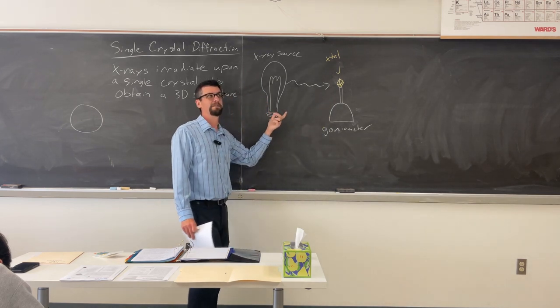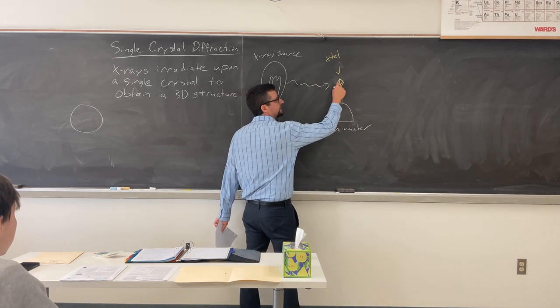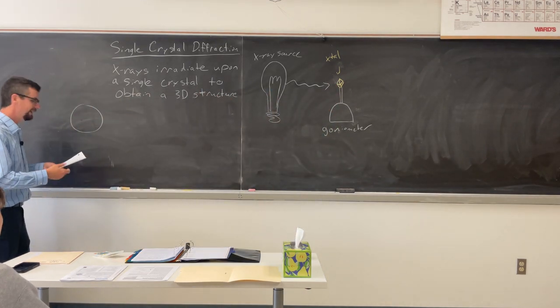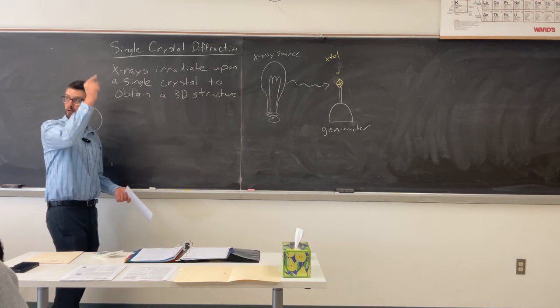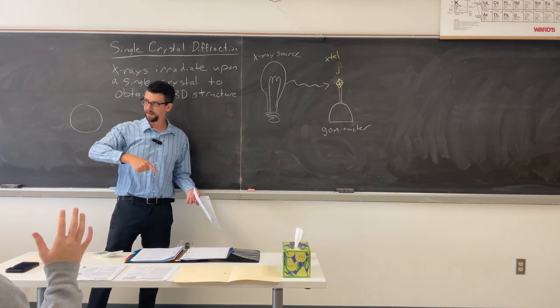Actually, I'm sorry, I guess that point does rotate too. You're trying to keep a fixed position so this thing moves. That was a horrible description. So you're just spinning it? Yeah, you're basically spinning it. You're spinning it around, but you're not moving it in the XY plane. You're just spinning it, trying to keep one axis stable.